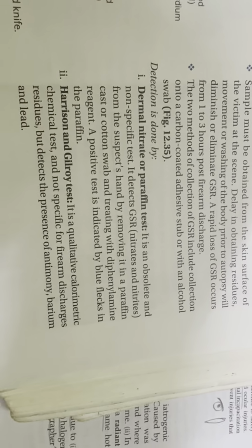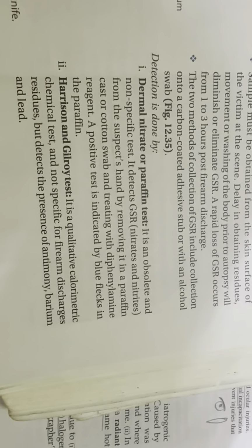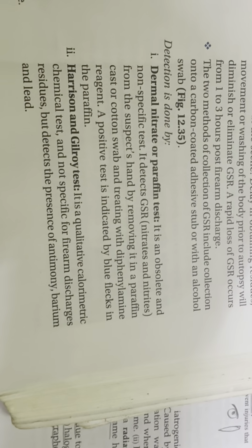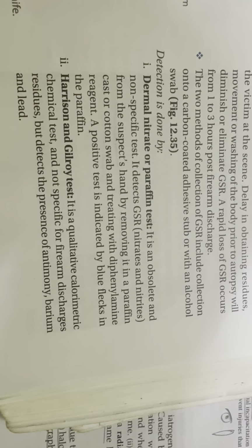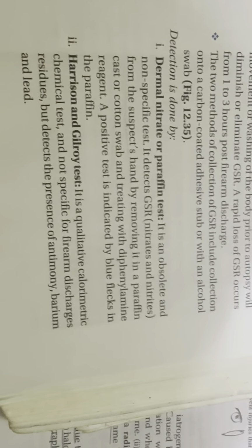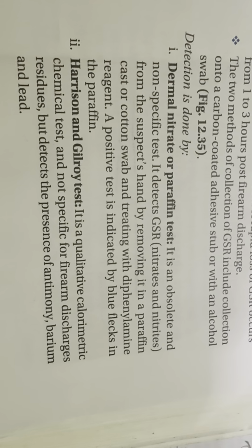Detection is done by the dermal nitrate or paraffin test. It is an obsolete and non-specific test. It detects nitrate and nitrite from the suspect's hand by removing it in a paraffin cast or cotton swab and treating with a diphenylamine reagent. A positive test is indicated by blue flecks in the paraffin.